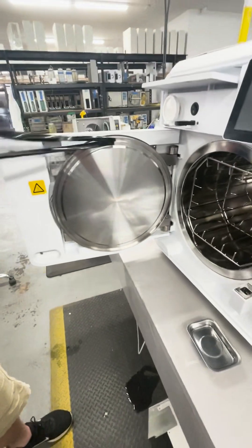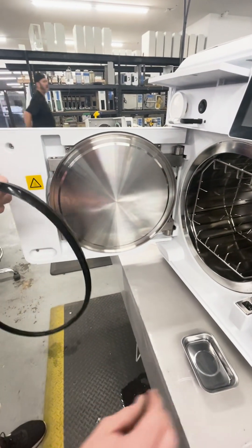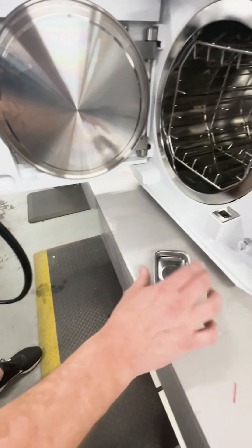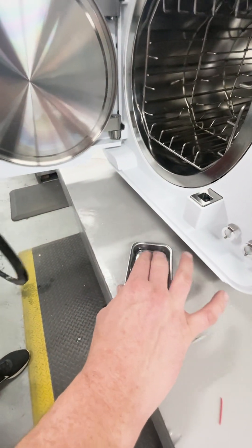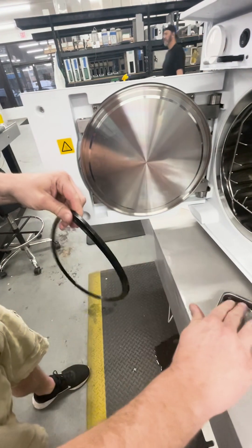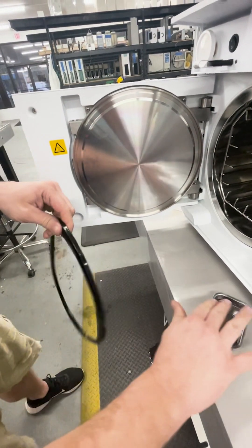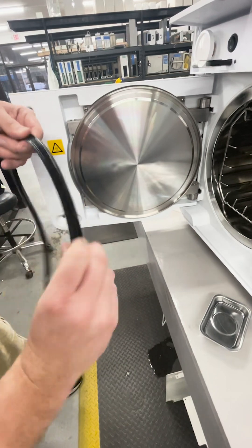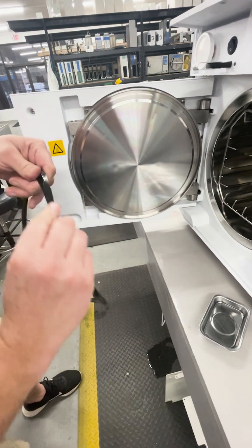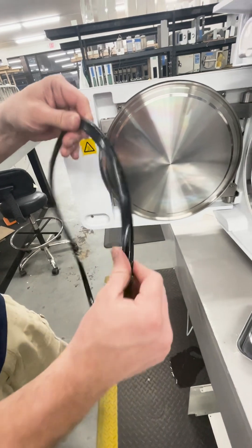That old gasket will just pull out. For the new one, I'm using mineral oil in this dish — I'm going to generously lube the entire gasket. This is just any mineral oil; you can also use non-detergent soap, anything non-detergent.